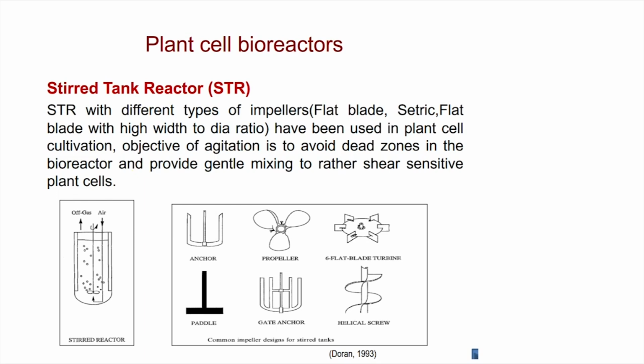But if the sparger was placed well below the draft tube, then there is a chance that dead zones would be created, because the bubbles will get dispersed at the bottom rather than all the bubbles flowing through that channel, creating density gradient and circulation currents. So, let us talk about the different configurations.